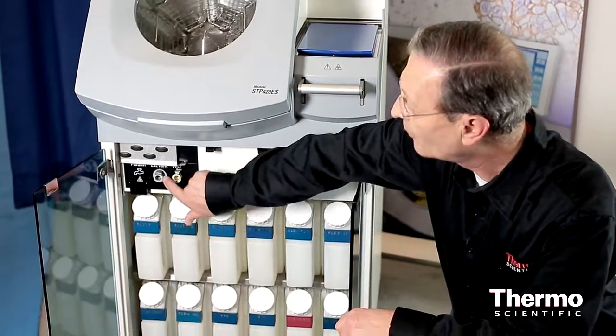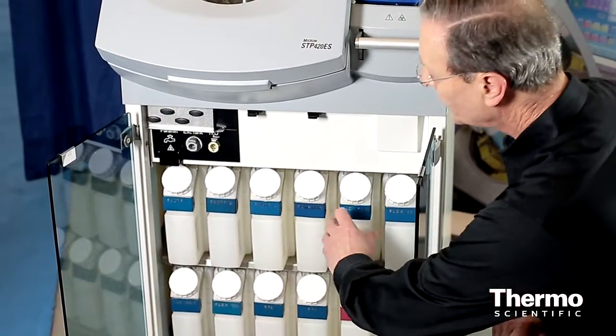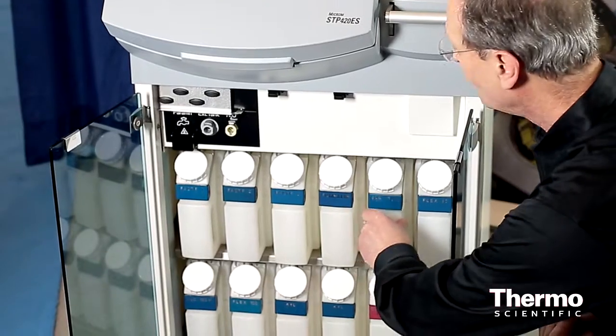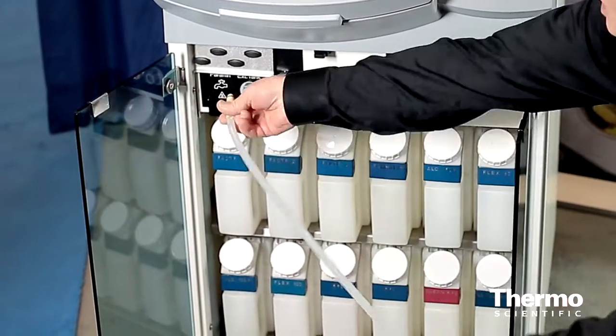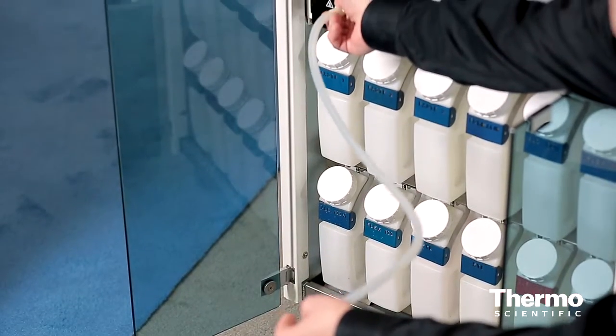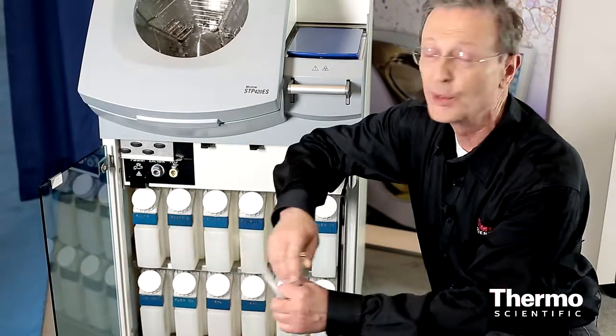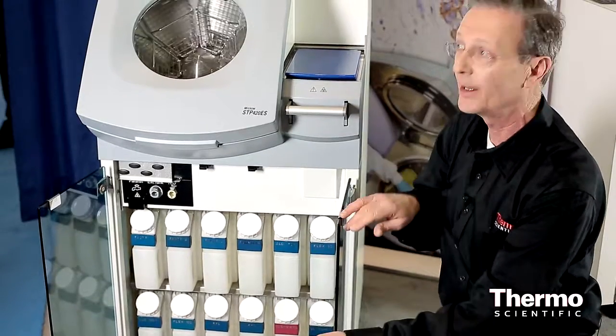In addition, we have remote fill and drain, so that means that if you don't want to take the bottle out and pour, you can actually plug the loop in here and empty specific bottles using the software, which means that you're not touching the fluid. So our users have a choice of how they change the reagents.